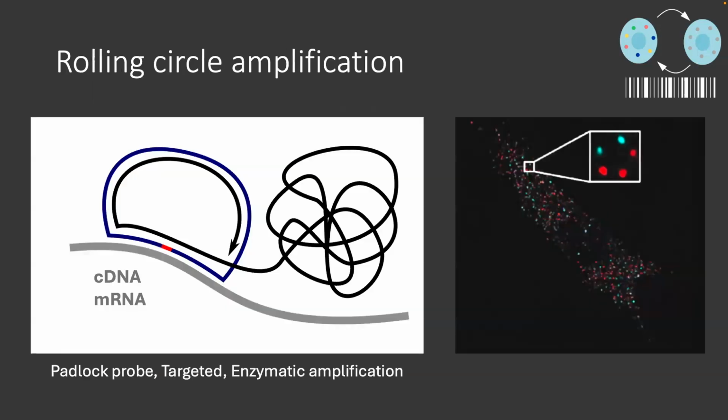All right, within this segment of barcoded FISH, there is also an amplified version. This originally came from the in situ sequencing group of methods that we will talk about later, but they now also apply a barcode rather than sequencing. These methods rely on rolling circle amplification. This is a way to amplify a DNA construct, and it works quite well in situ.